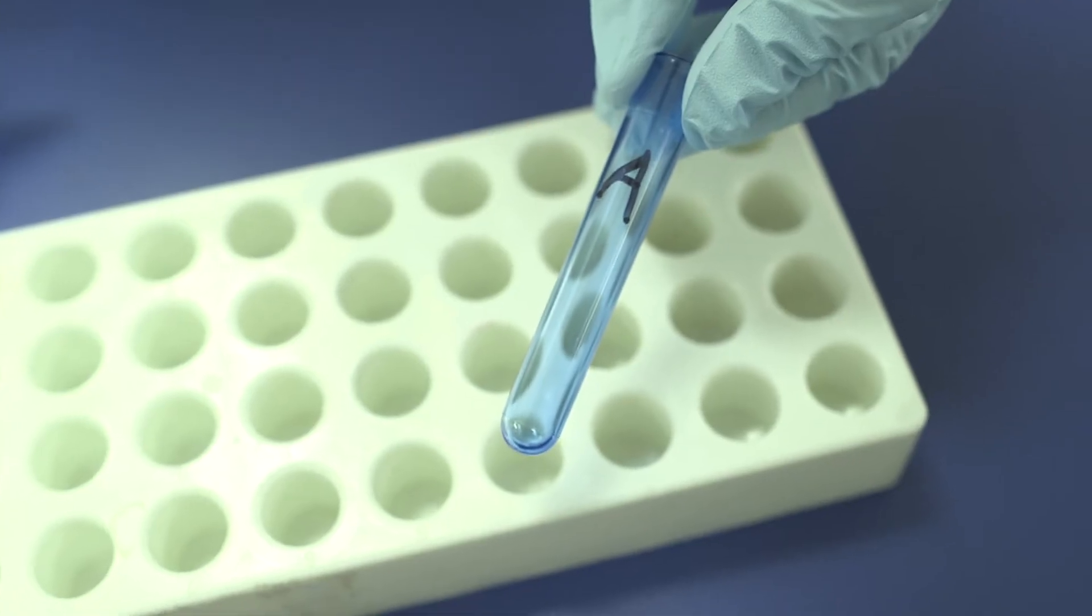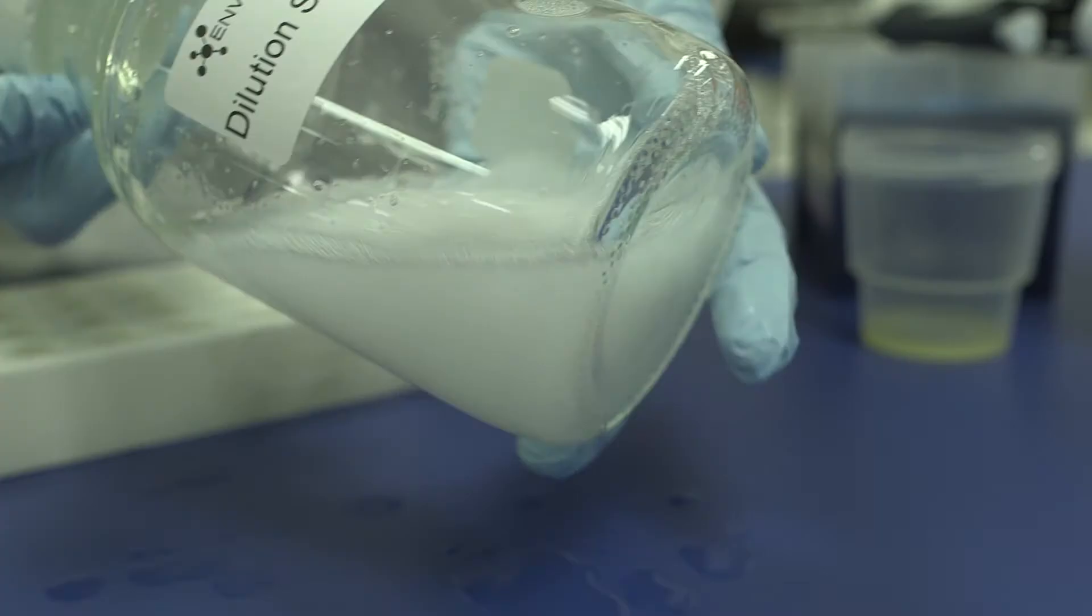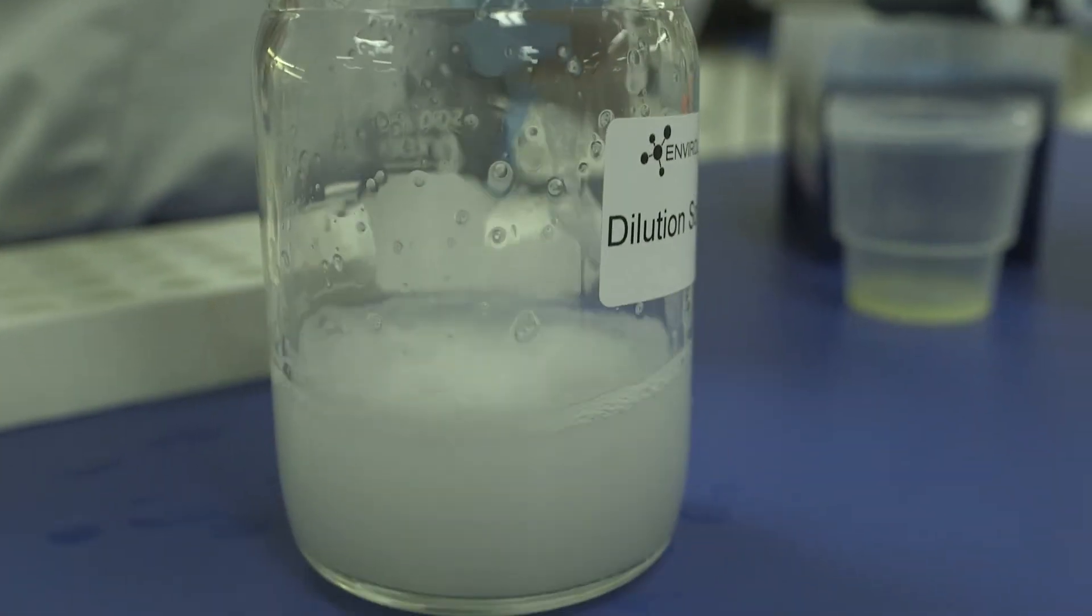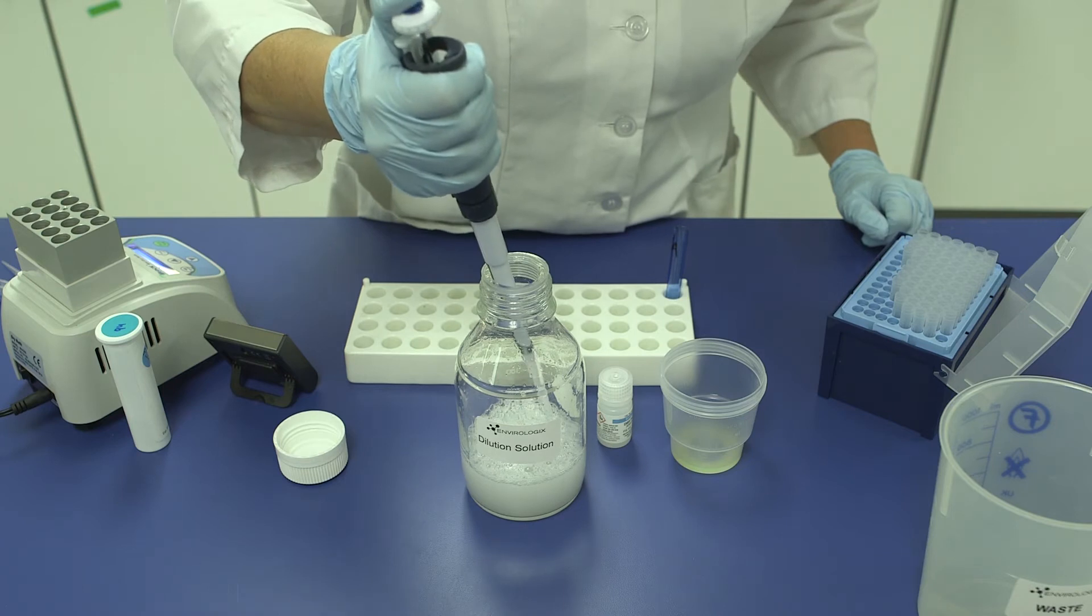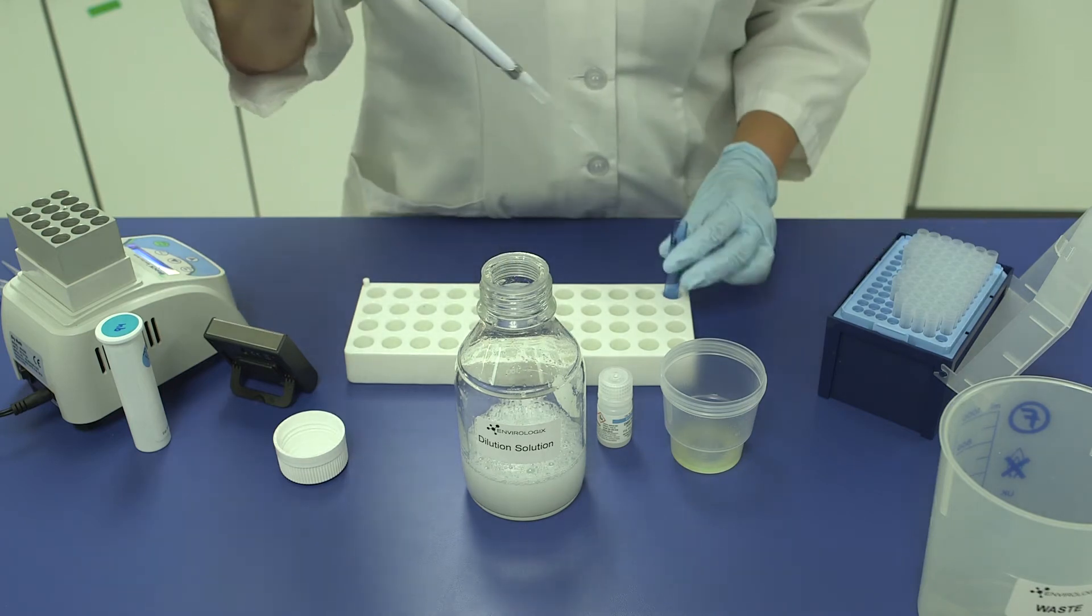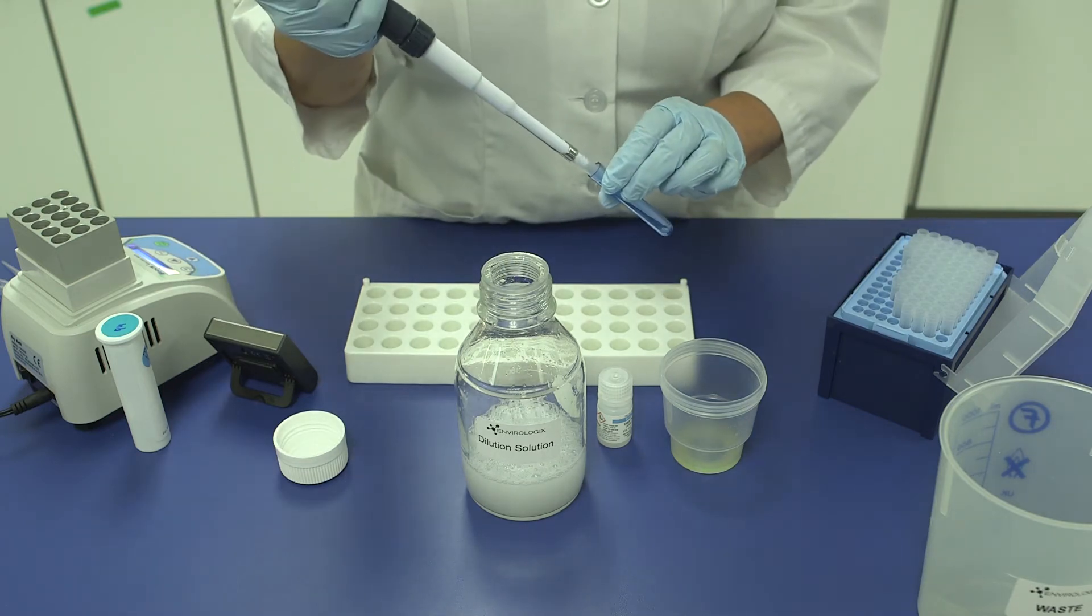Dilution A, Step 1. Add 400 microliters of well-mixed dilution solution and 100 microliters of clarified extract to a clean tube. Mix well.